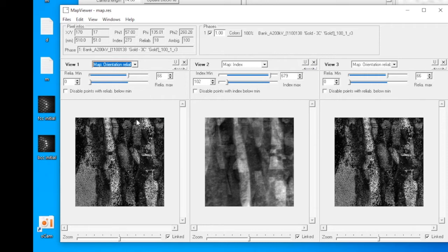If the best match is similar to the second best match, then that tells us there's a lot of ambiguity, and the pixel will appear to be dark.